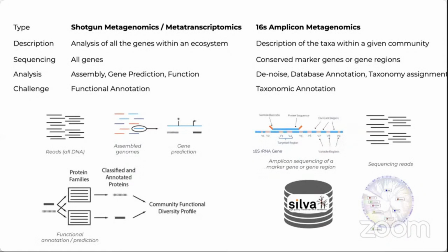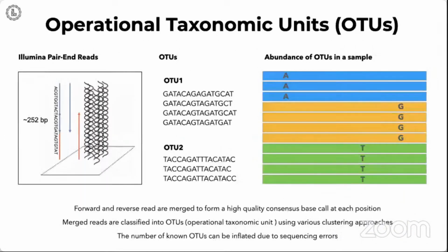How are they generally performed? In addition to sequencing these PCR amplified products of the 16S rRNA gene, we pool them, or we generally cluster them in groups of closely related individuals as defined by their sequence identity or sequence similarities, right? These consensus sequences are defined as operational taxonomic units, and their abundance is characterized and quantified for different samples.